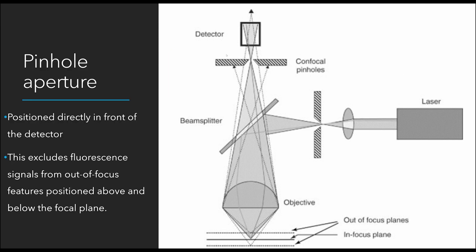This is again the heart of the microscope, the pinhole aperture. The light will be coming from different planes, but this confocal instrument collects only the light from a particular plane, and the stray or unwanted light is blocked by the pinhole aperture, so that the image obtained in the confocal microscope will have very high resolution.